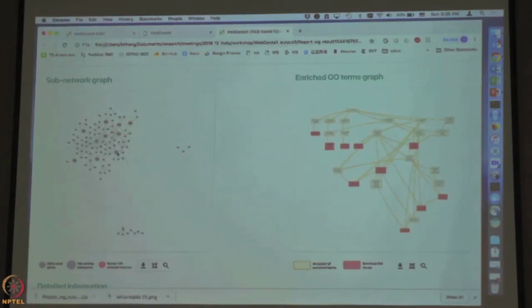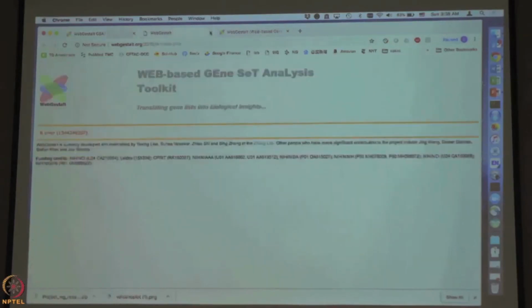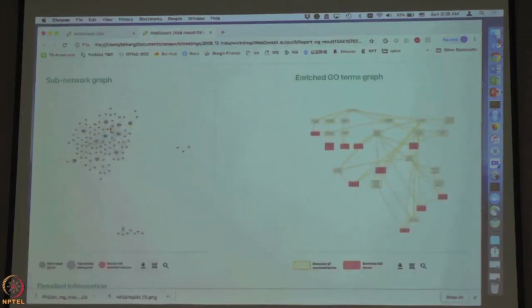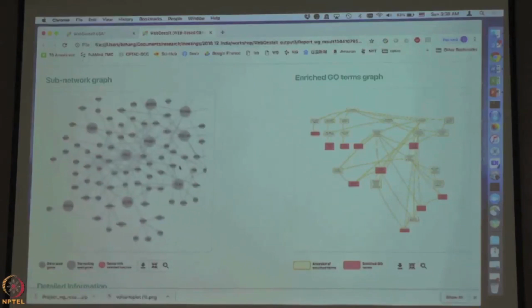And then you notice that in the top 10 genes, because your parameter is that you want to highlight the top 10 genes, these are the 10 genes that are highlighted, and then you can zoom in, and it will tell you, for example, FN1 and ELN, collagen A1, and TGF beta 1.